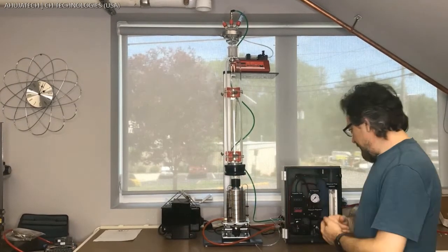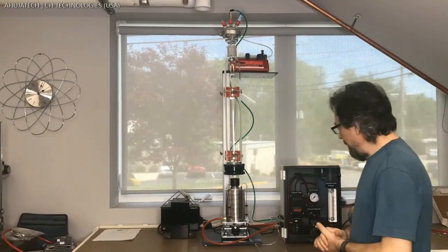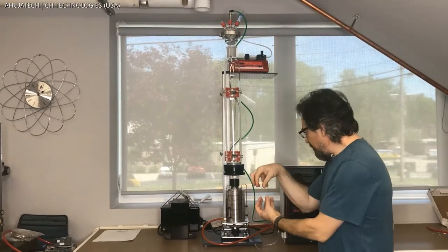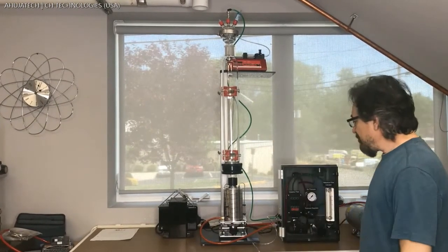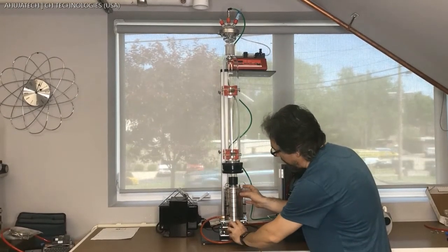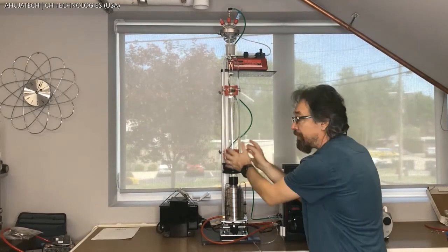At the bottom of the setup we have the viable impactor, which is coupled with a special design attachment with o-rings on both sides. It sits on a lab jack which allows us to lift or lower the impactor without moving the column.